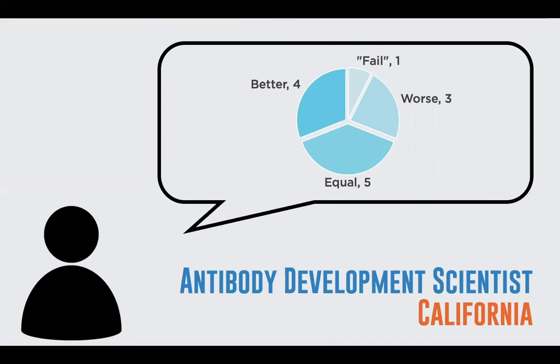And this client was developing everything for kits here. But because they performed a little bit worse, but they had this immortalized sequence, it didn't really matter to them. They could just essentially modify the concentrations here and optimize the conditions so that it was still ultimately able to be converted into a commercializable kit.